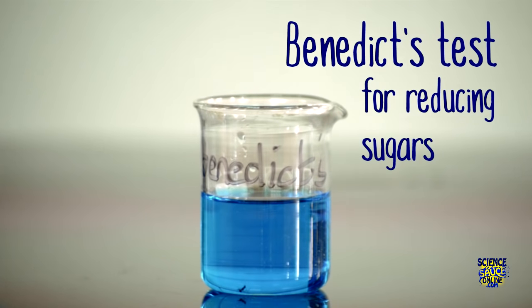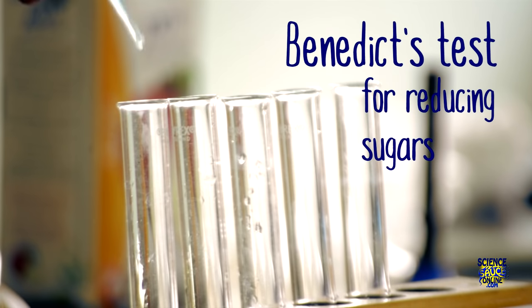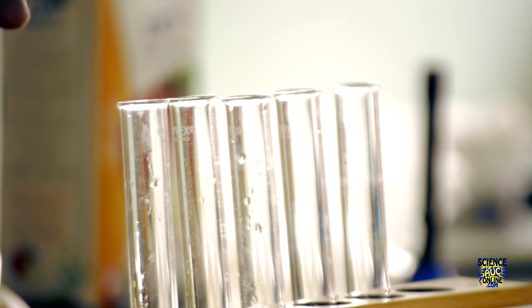The Benedict's test is the test for reducing sugars. Glucose is an example of a reducing sugar. First you take your Benedict's reagent and you add it dropwise to each of your samples.